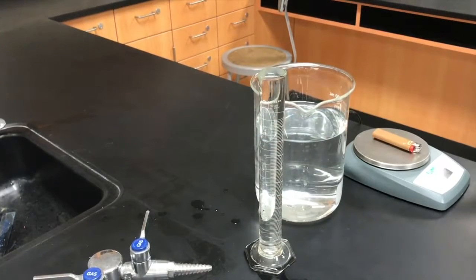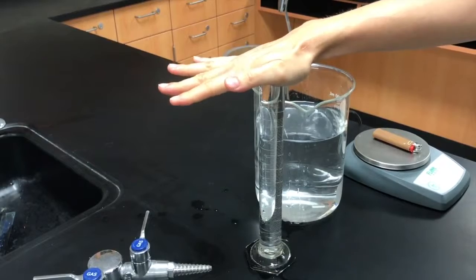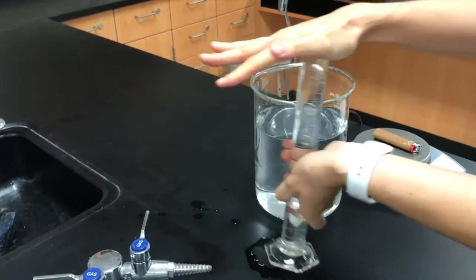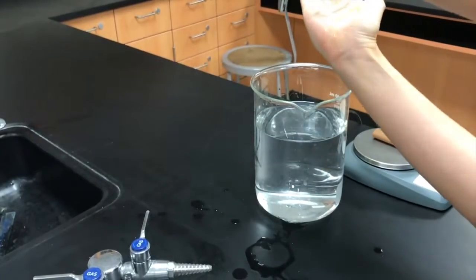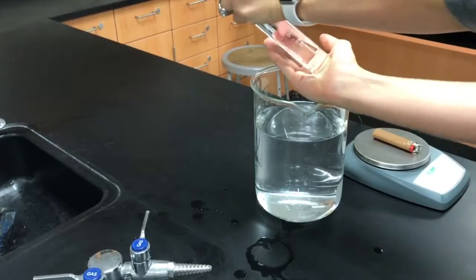Okay? So this is the hardest part of the lab, and this is where you're going to get a little bit wet, and you'll be okay. Okay? So you're going to take your hand and you're going to cover the graduated cylinder. Okay? You're going to invert the graduated cylinder. Okay? Notice I don't have any air bubbles. If you look at that, I was able to avoid that. This is the messy part.